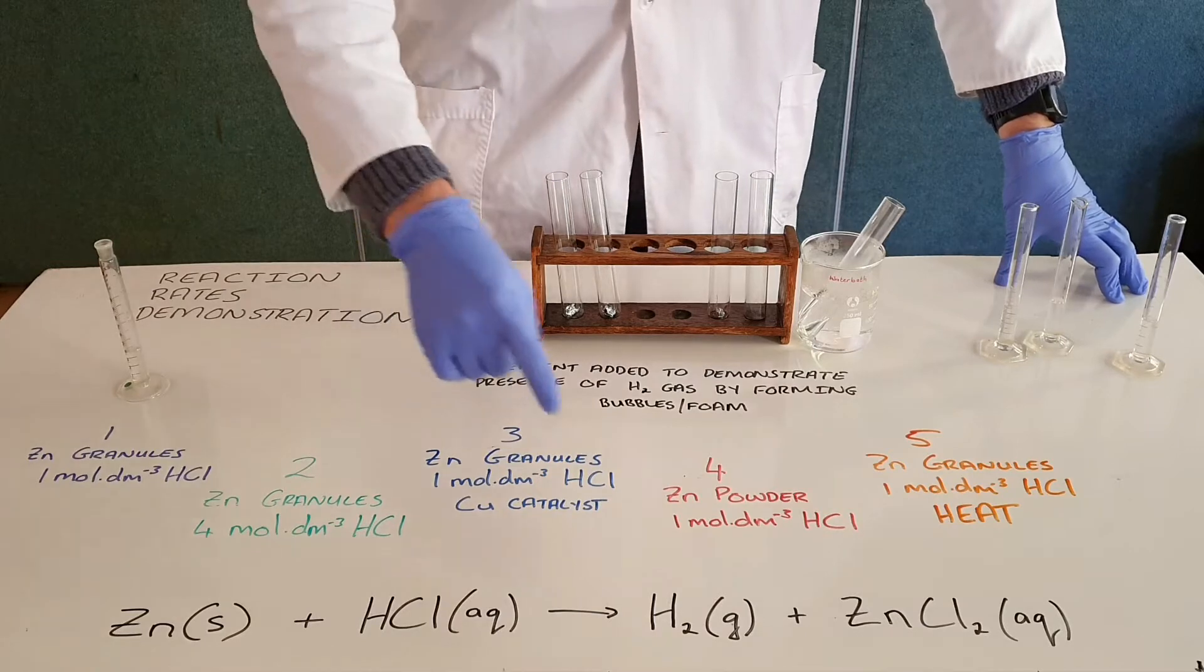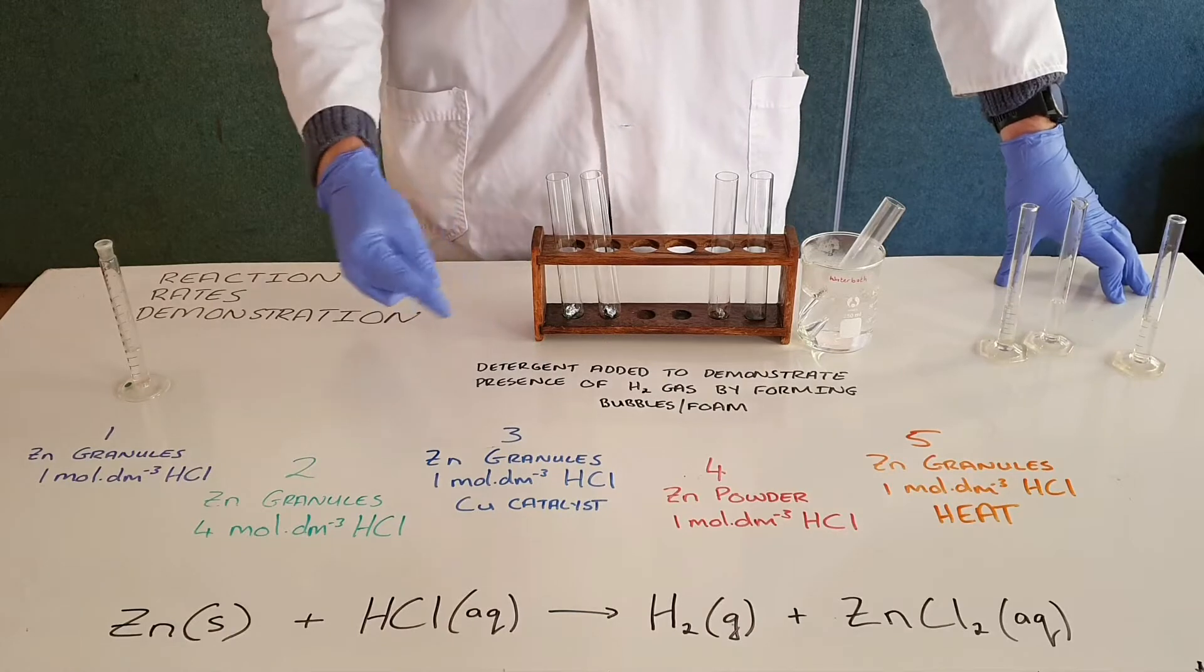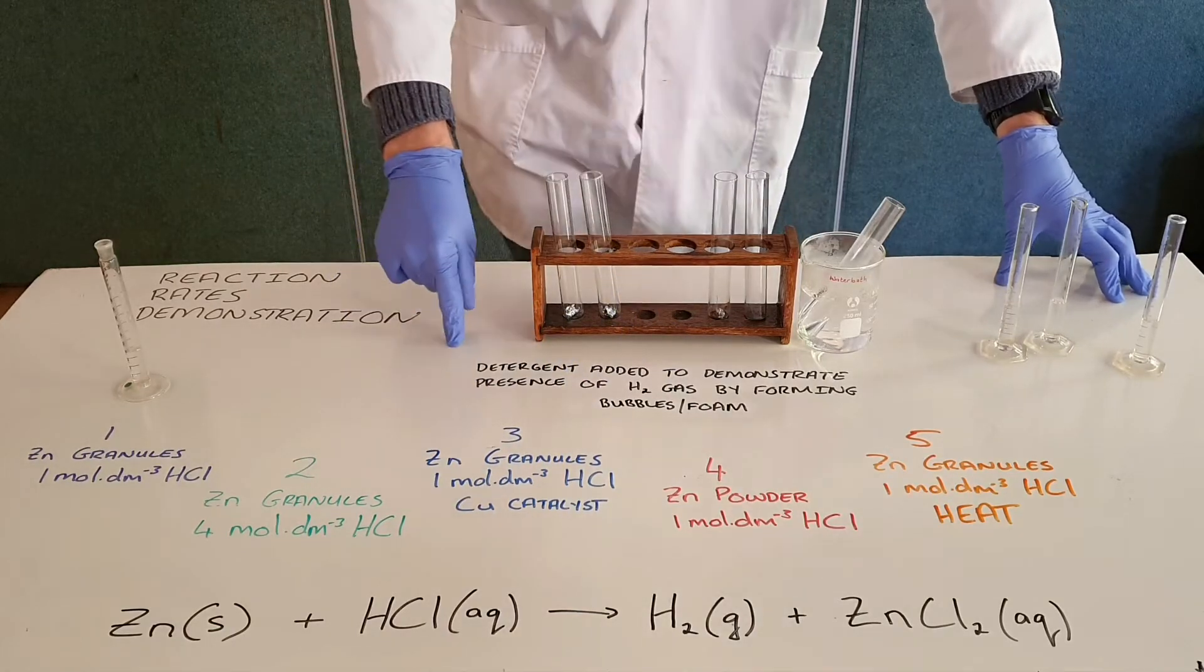So the first thing that we do is because we know that hydrogen gas is produced, we add some detergent that will form bubbles or foam as the reaction proceeds and obviously form more foam if more hydrogen gas is produced.